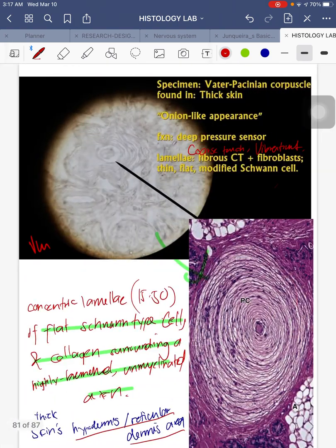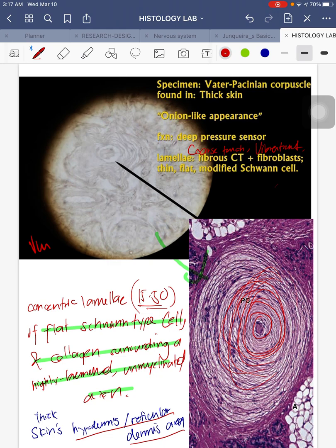Next is your Vater-Pacinian corpuscle, found in thick skin in the hypodermis or reticular dermis area. It has concentric lamellations — 15 to 30 layers — which are concentric lamellae of flattened type-1 cells and collagen surrounding a highly branched unmyelinated axon. The Pacinian corpuscle functions as a deep pressure sensor and also sends coarse touch and vibration signals.